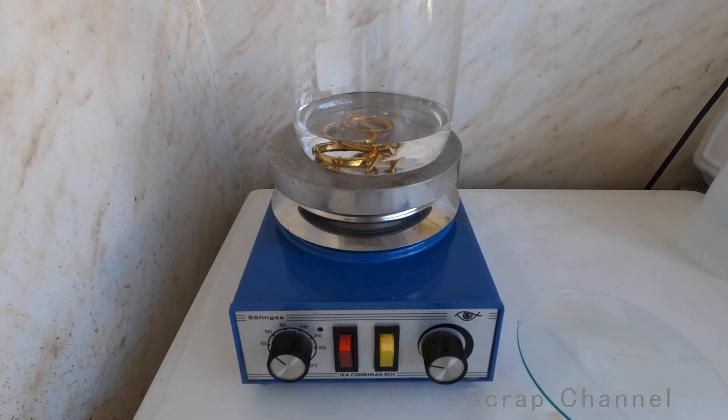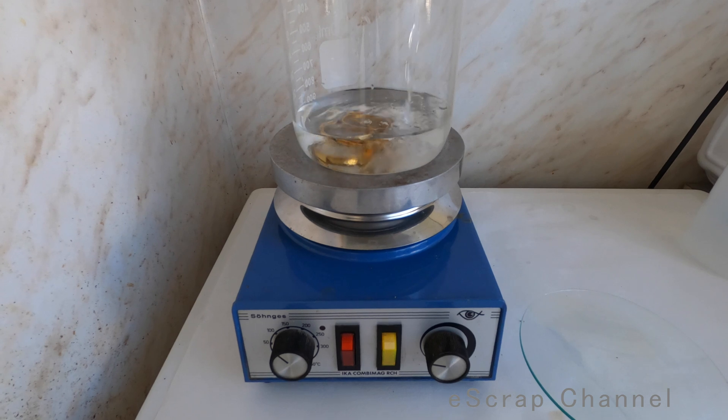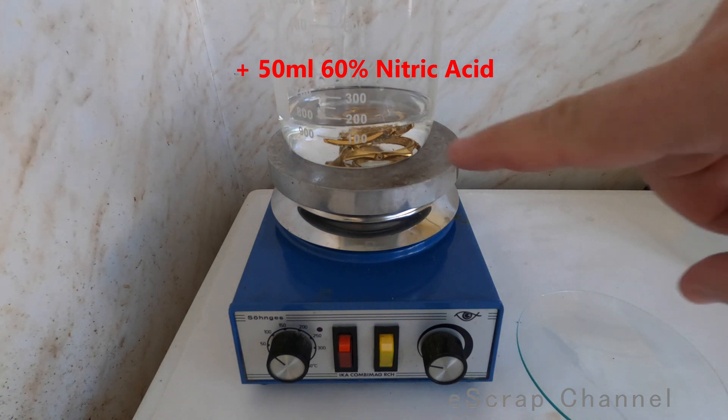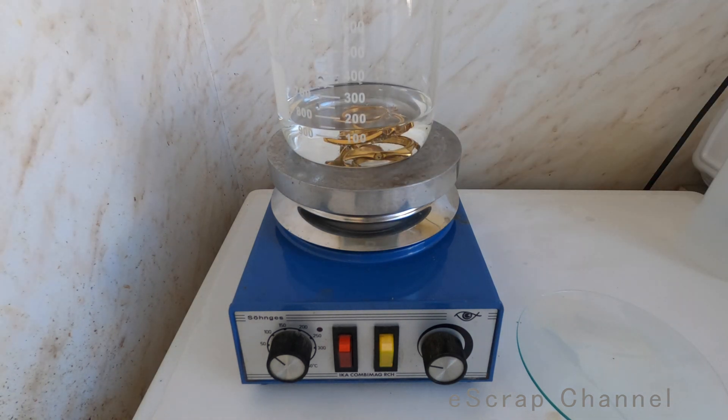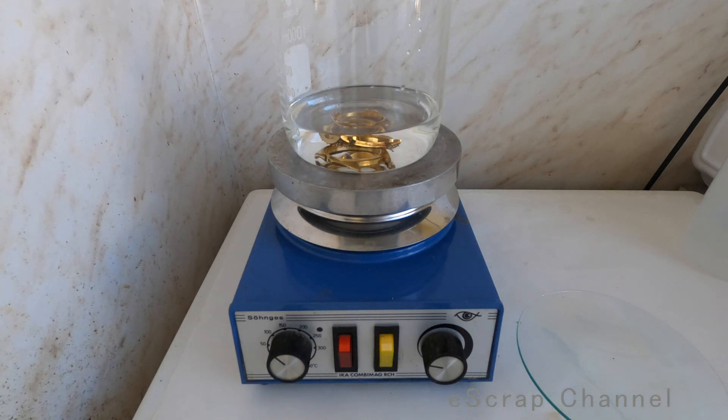Hello guys! So we are in the lab. What we have here in the beaker? We have the two cases from the watches and we have distilled water — 100 milliliters of distilled water. It's important to use distilled water because if you add tap water you may have chlorine inside and you may dissolve part of your gold, which I'm sure you don't intend. The next step is to add nitric acid. As I said we'll need about 75 milliliters in total, but I'll start with 50. There were 100 milliliters of distilled water and I added about 50 milliliters of 60% nitric acid. The reaction will slowly start.